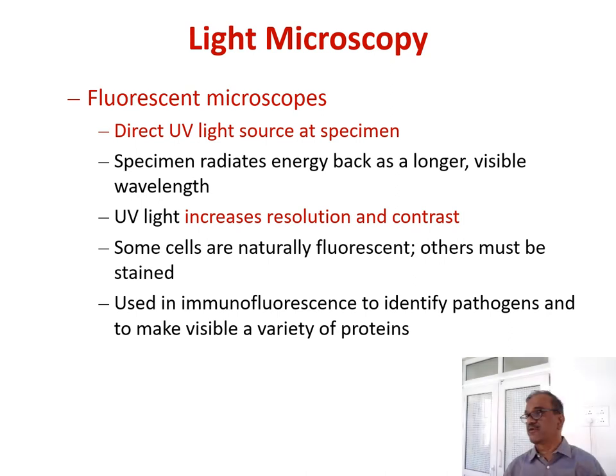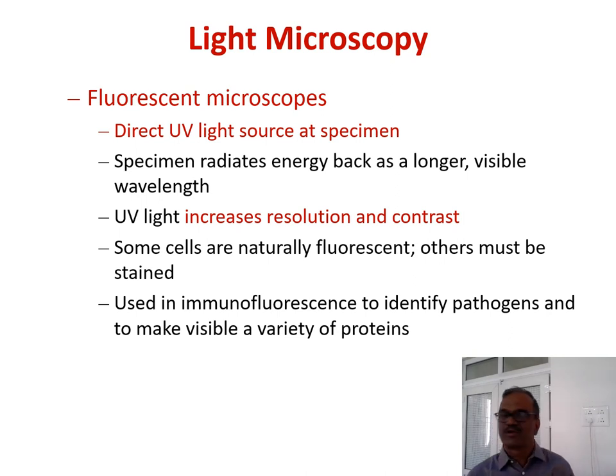Then fluorescent microscope. Okay, by the name itself it is self explanatory. What is fluorescence? I think ladies should know. Fluorescent color you are selecting for your dress, isn't it? Or the painters, gents, fluorescent painting. Fluorescent colors are used for painting. They glow in the dark. Am I right? They glow in the dark.